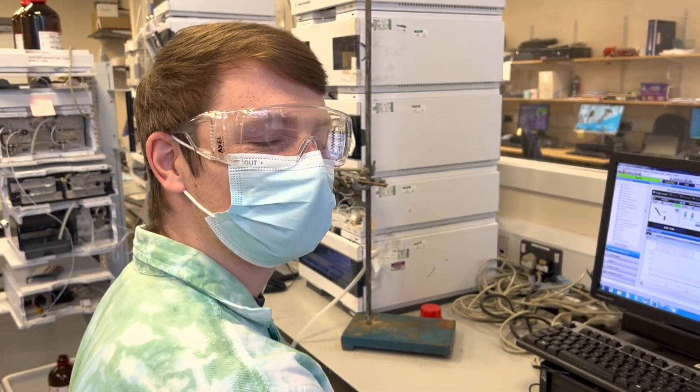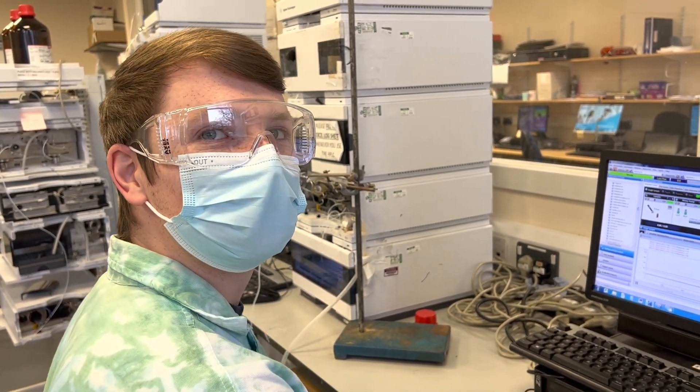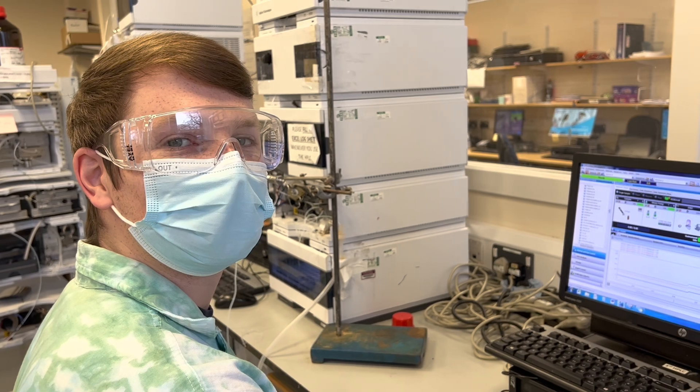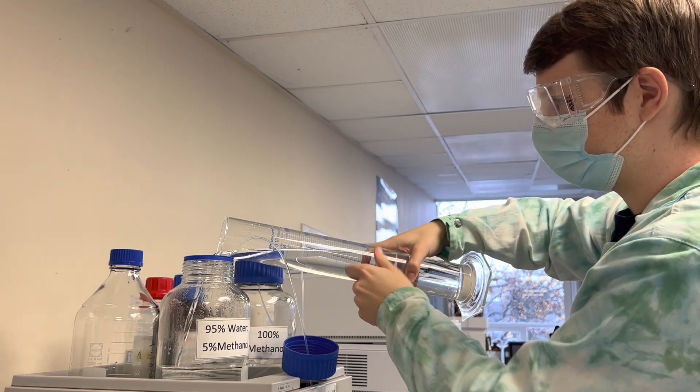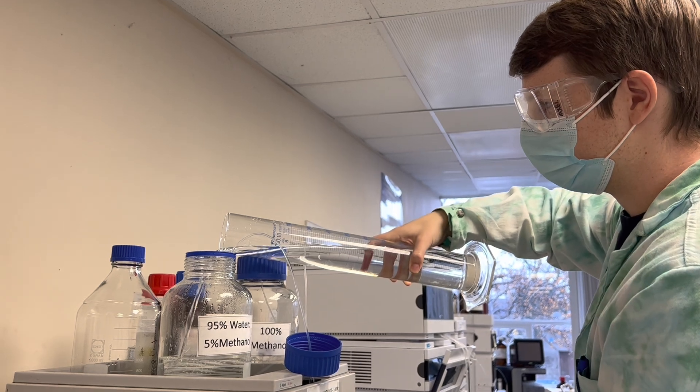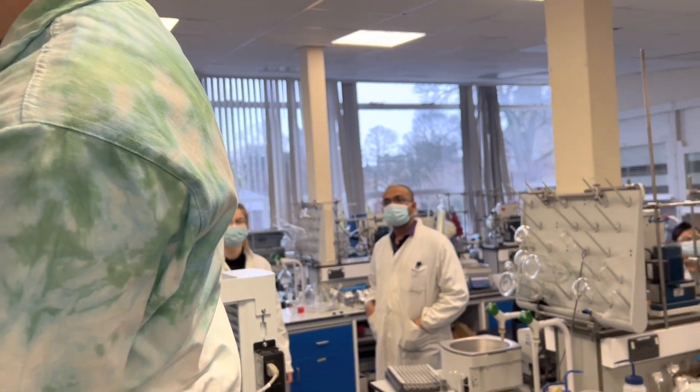So Axel, what are we doing today? We're doing an HPLC! Yes, we are — I'm training you on how to use it. Axel's first HPLC at the MBC!